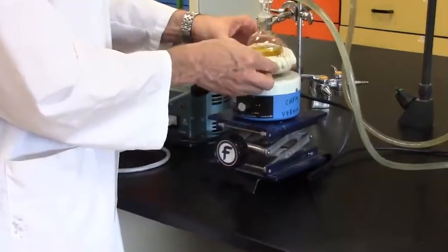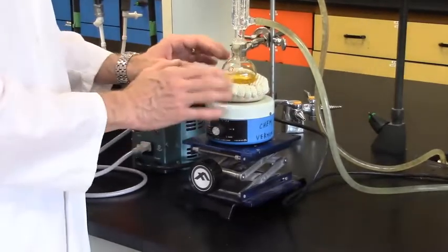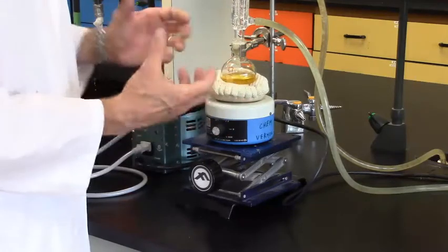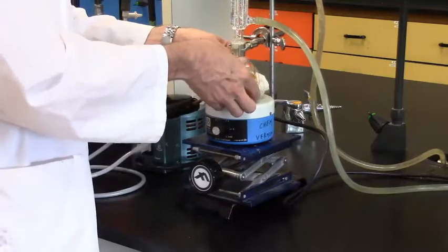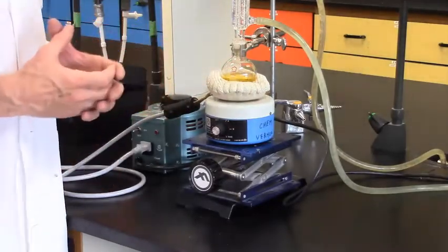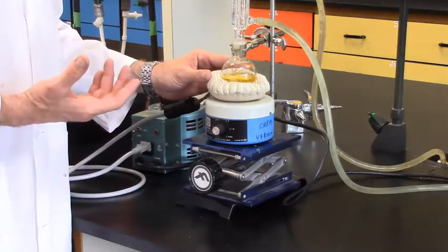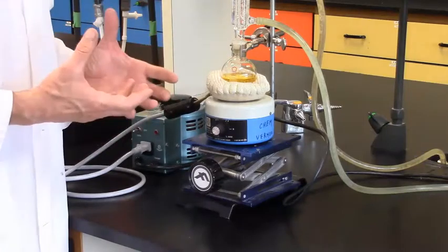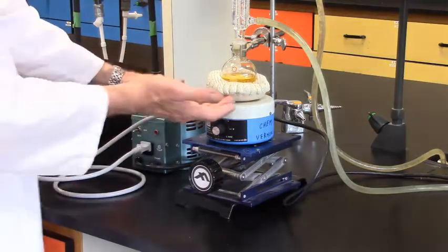It is important that the flask fit relatively snug in the mantle. Using the lab jack, I like to make sure there is good thermal contact. If there's not good thermal contact, the mantle will get very, very hot, won't heat the flask effectively, and can actually burn out due to too much heat buildup. I like to snug it up and rotate it around to ensure there's nice snug contact all the way around. If the heating mantle does not have good thermal contact, check other heating mantles of the same size — different manufacturing batches or age can cause them to change shape. You'll need to find one that fits, otherwise heating will be ineffective and you can damage the mantle.